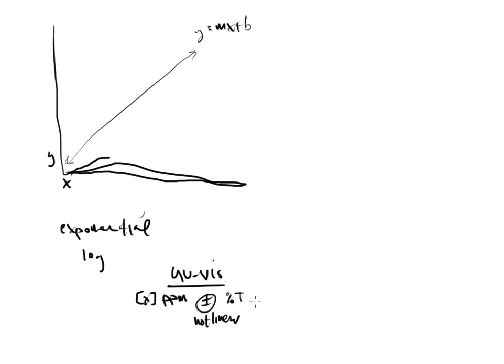We wanted something that would fit kind of cookie cutter everything else that we were doing in a lab. And we decided not to measure percent transmittance anymore. Instead, we went to a different unit called absorbance. There's a relationship between absorbance and percent transmittance: absorbance is equal to the negative log of T. So we mathematically changed the values of the y-axis, and when we did that, we conformed it to a linear relationship that we were very comfortable working with. So whenever we see these types of cases, that's always our first instinct. If we are seeing a relationship that is not linear, can we do something about it? Can we bring in a little bit of mathematics to change that number so it can become linear when we plot our curves? Because that's going to be the easiest way to handle the data.